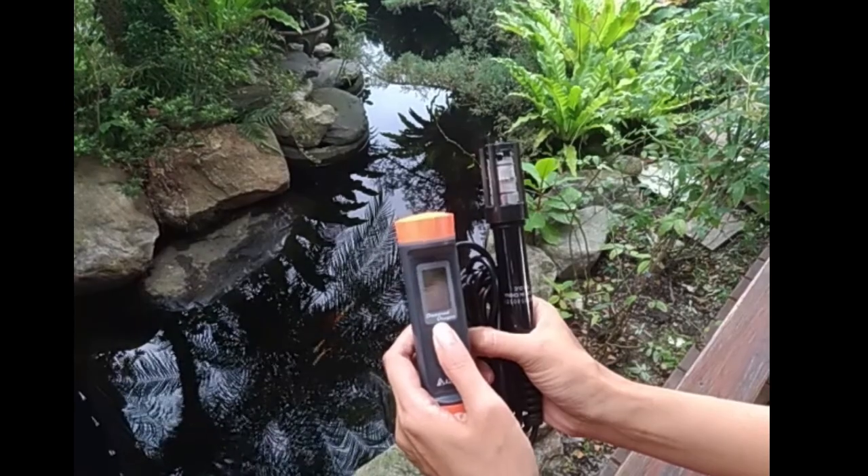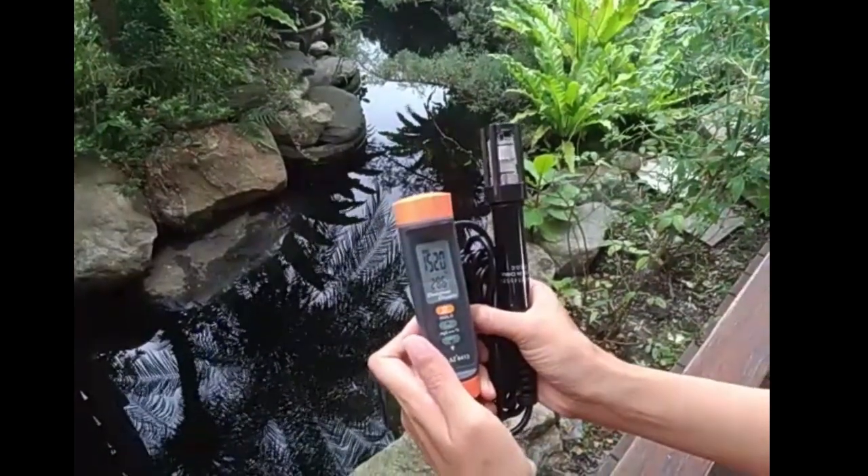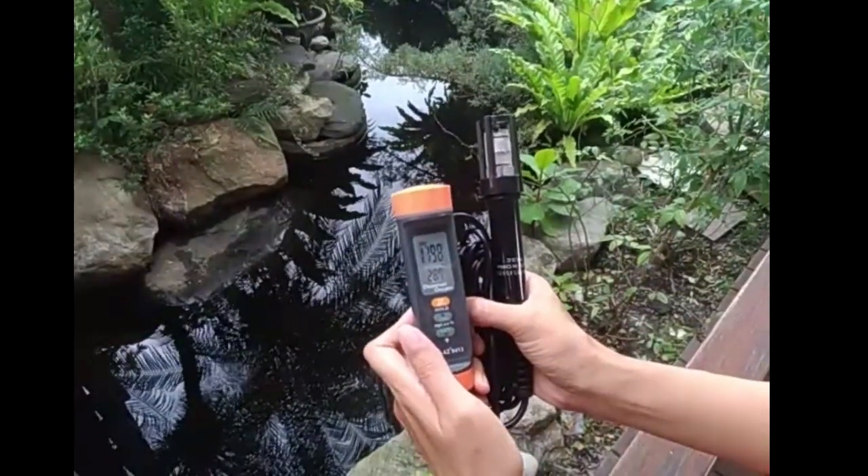Press the power button to turn it on. After the first boot, please give 5 minutes of polarization time. The stability of the product will be better.